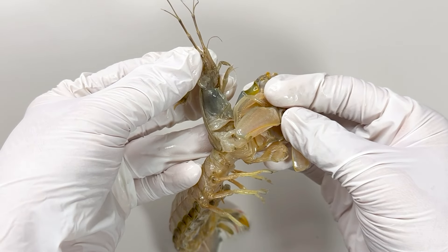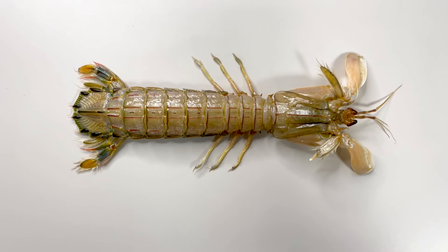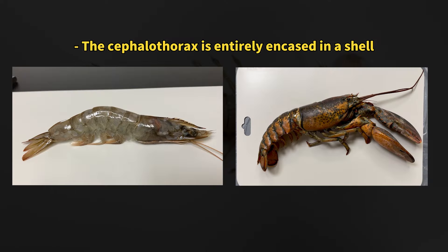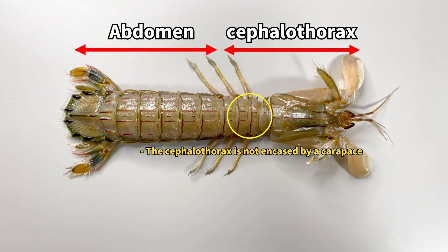The food then travels from the mouth through the stomach to the digestive tract in the abdomen. If we look at the mantis shrimp from behind, unlike crayfish and shrimp, the cephalothorax isn't completely covered by the shell, so the rear part of the thorax is exposed.